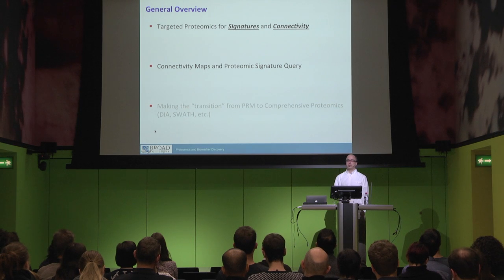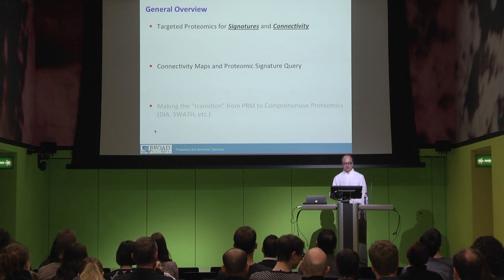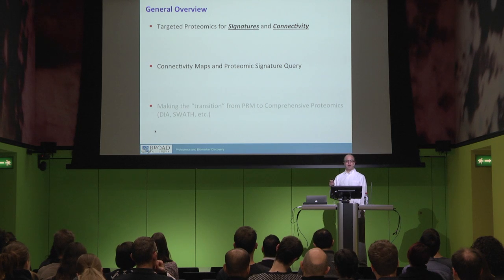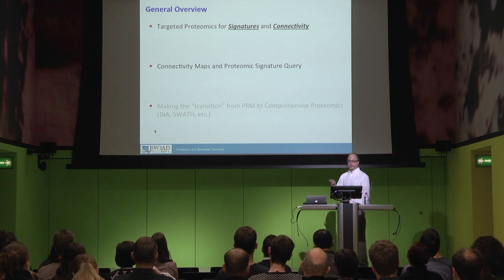And if there's time, which I don't think there's going to be, I can talk a little bit about converting what is a PRM assay into a hybrid PRM DIA assay. If I don't get to it today but you're still interested, I'd be happy to talk with you in the breaks about that.